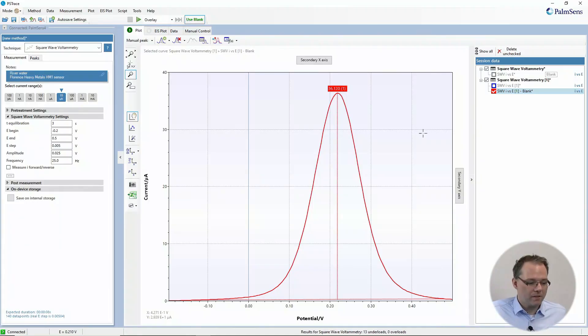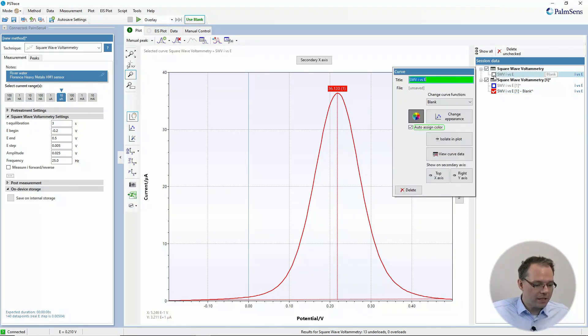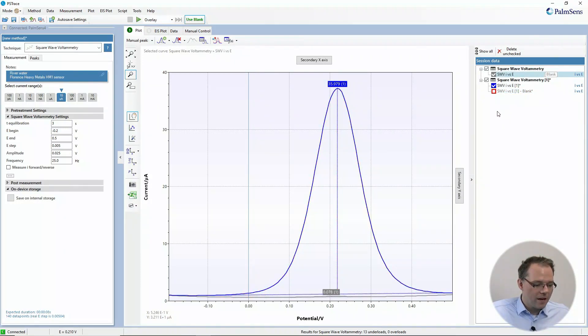That's possible as well. I've actually already explained it in the curve operations video, so if you're looking for that on our YouTube channel, that would help you. But for the sake of being complete, I want to demonstrate that quickly here as well. So an alternative way of doing it: let's say you had made these two measurements.